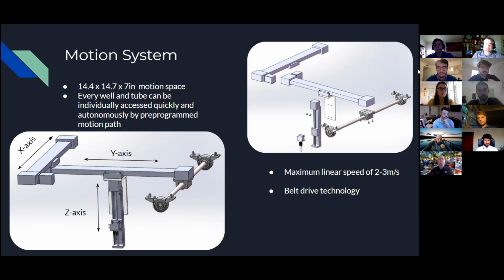The basic function sequence is as follows. The user can create any number of command sequences using G code or a similar code, much like you might program a CNC mill. Once the program is created, the user simply needs to push a button and the system will begin moving the dispenser to its desired location. The dispenser will move down to pierce through the rubber caps and begin depositing liquid or gas. Alternatively, input can come from the optical density and fluorescent intensity sensors, which could trigger addition and removal of culture medium or gas without the need for user involvement.